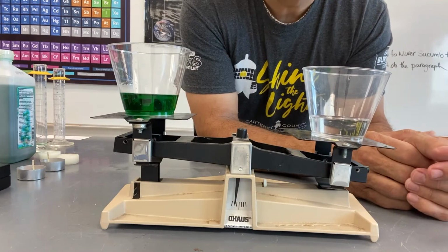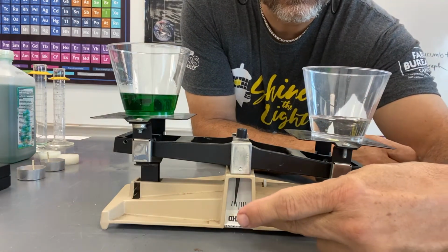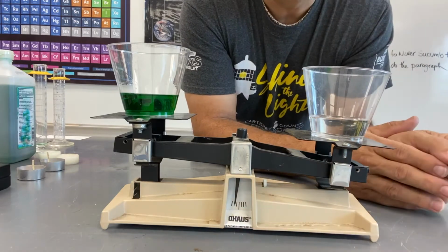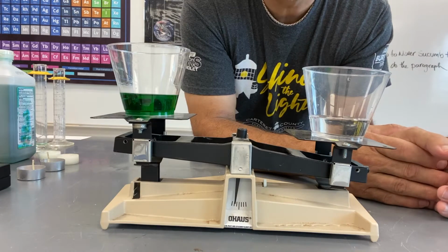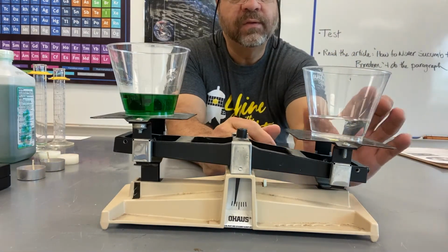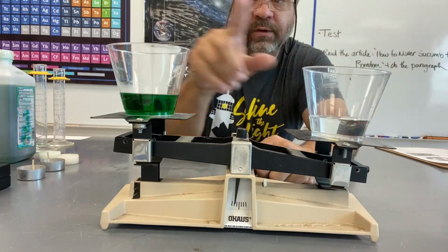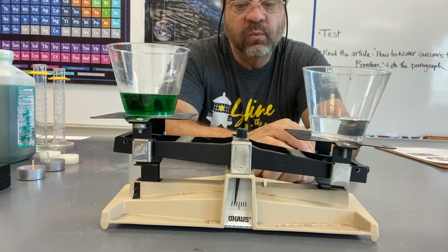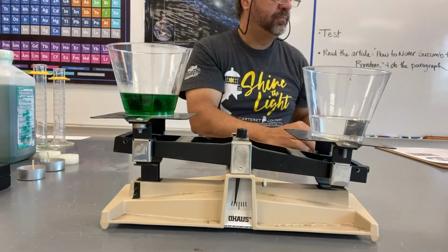And what do you notice? If you look at the scale here, it's not measuring in grams or ounces or pounds or anything, but it does show you which way the scale is tilted. Plus, you can just visually see that this side is lower than this side over here. So again, this is water, this is alcohol. So what would you say? Is water more dense than rubbing alcohol? Think about that for a second.